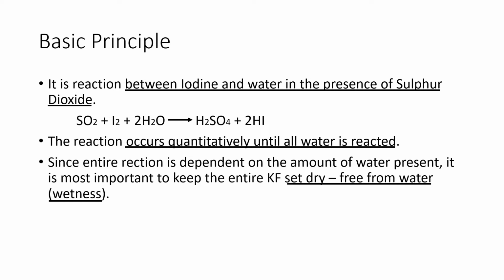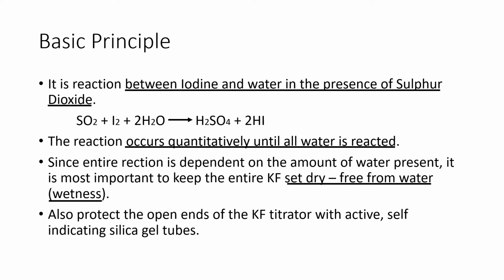To achieve this, you can have a system. A system may be to protect the open ends of the Karl Fischer titrator with active self-indicating silica gel tubes.